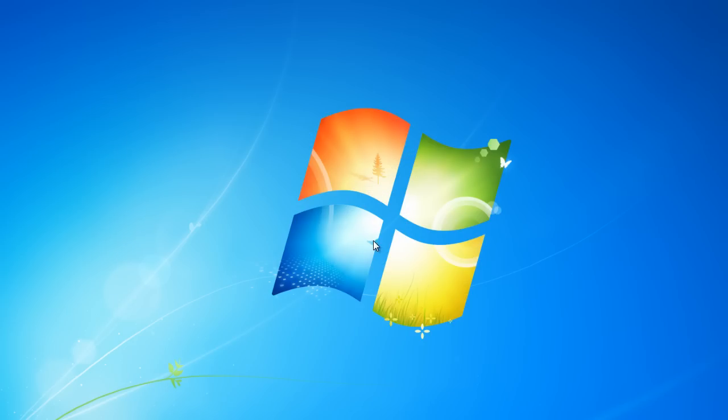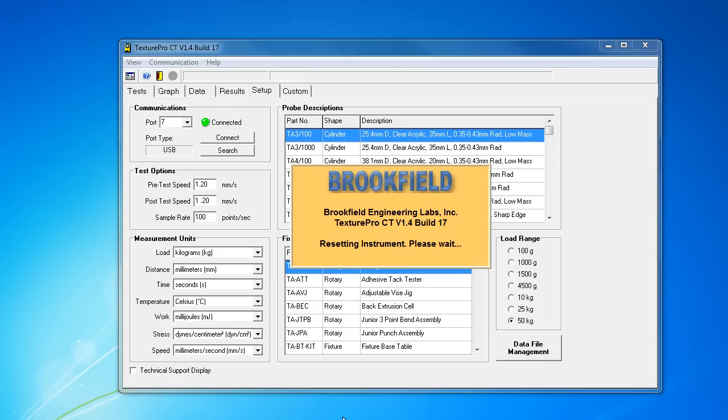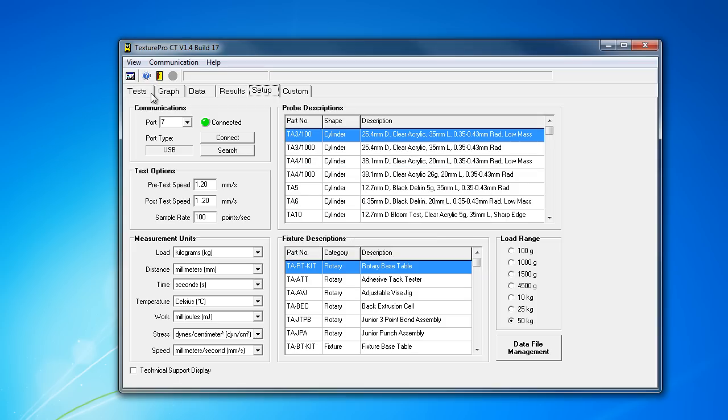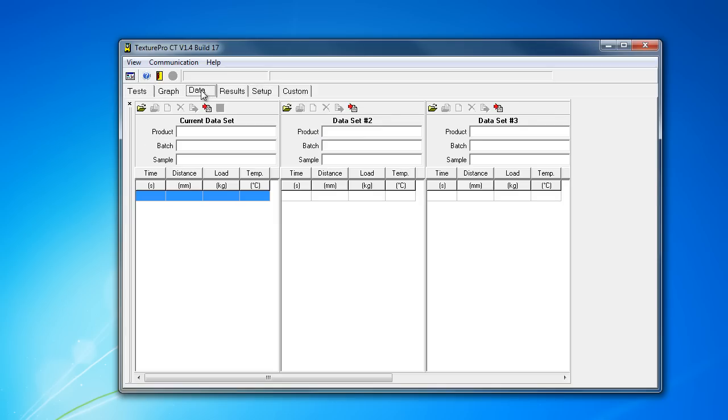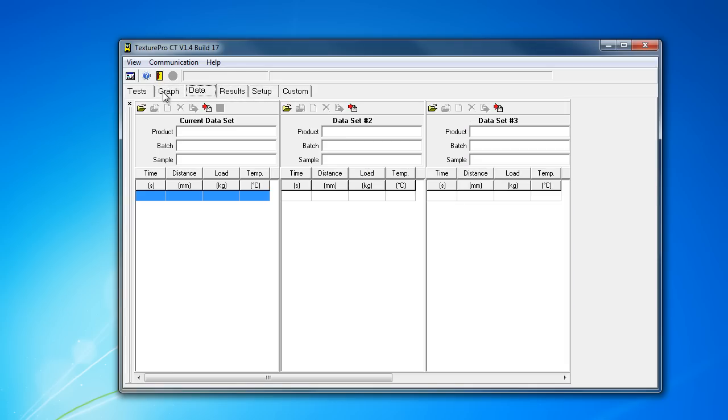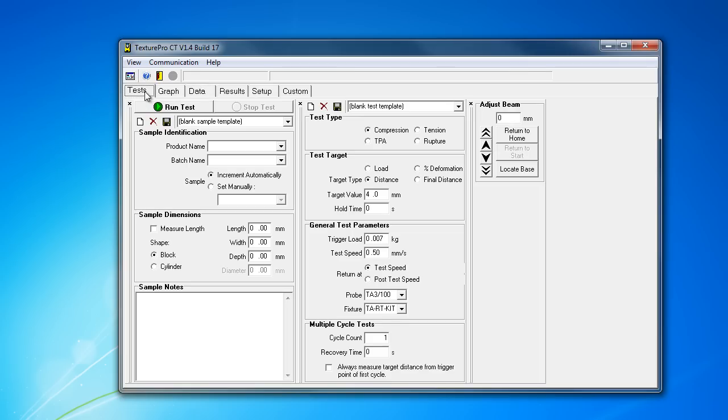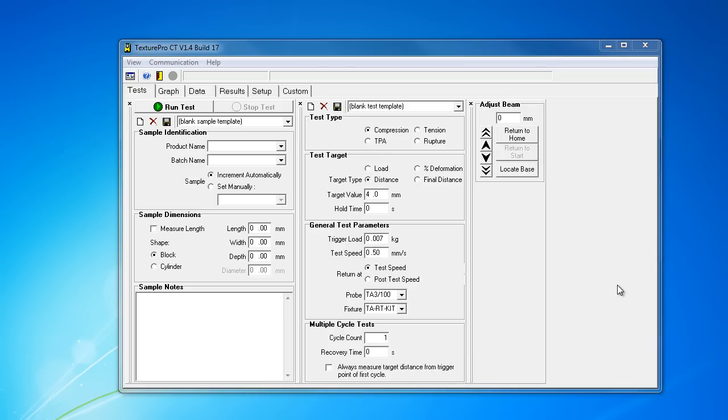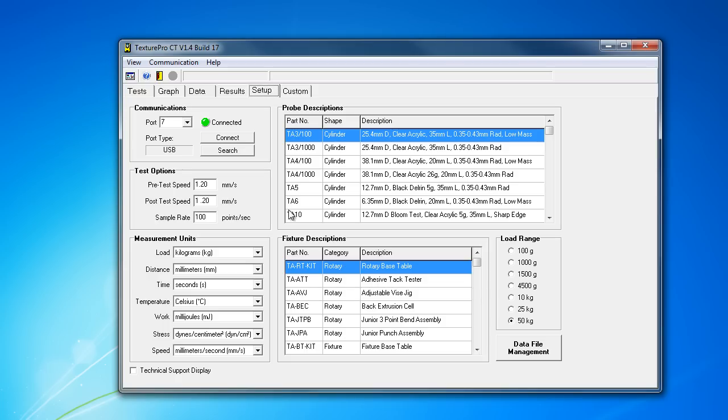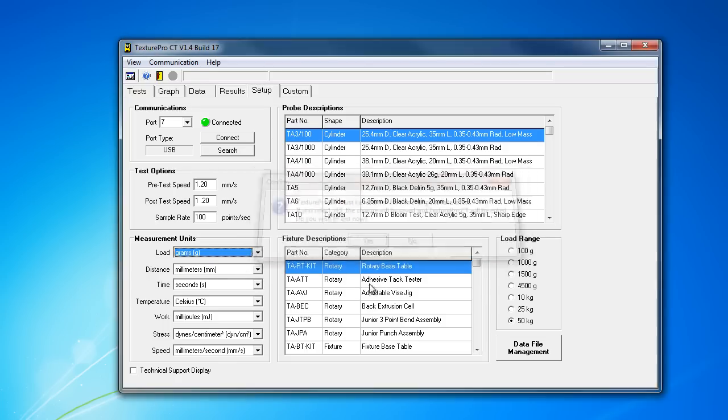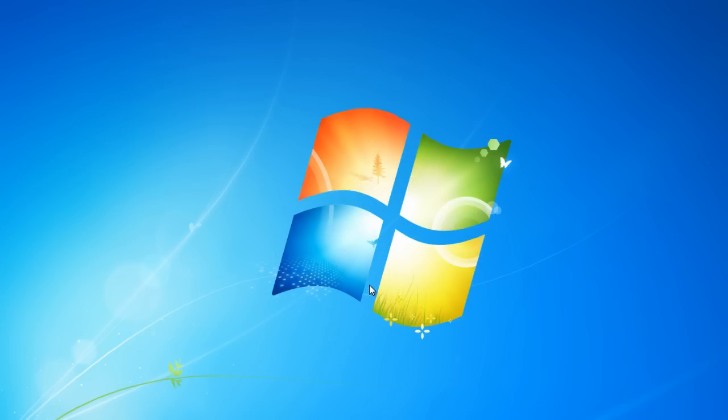It doesn't really sound like I've got a choice here if I want to change the units. It's nice enough to close the program for me. Boot it back up again. What do you find? You find out it restarts the instrument. It resets the position of the probe. It has to reload everything. All your units in the settings get changed. Not only does it unload your data, reset the machine and reset the program, but it just doesn't like changing units. Well, I don't really want it in kilos. I'd prefer it in grams. So, I'm just going to swap that back.